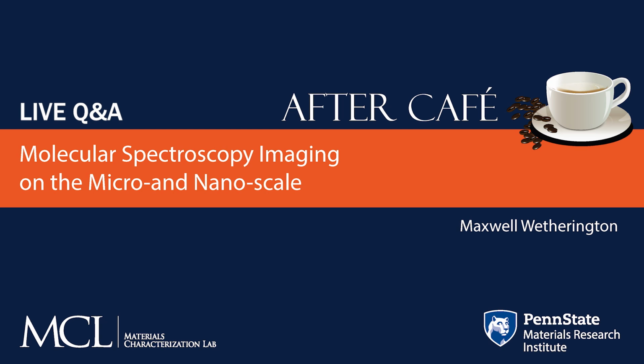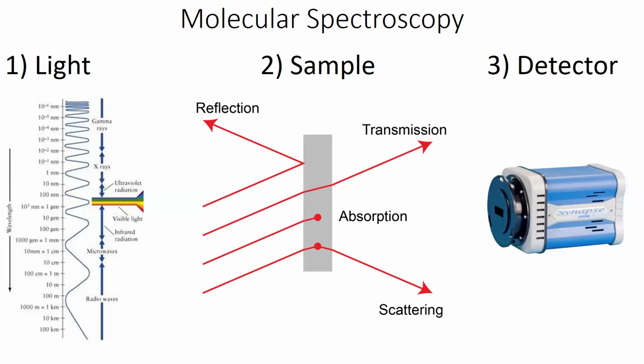My name is Max Wetherington, talking about molecular spectroscopy across length scales. To begin, molecular spectroscopy simply is the study of light interaction with matter.